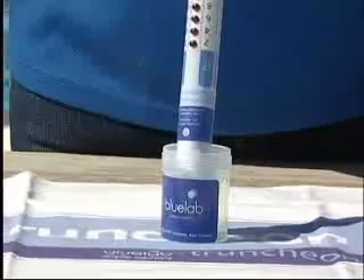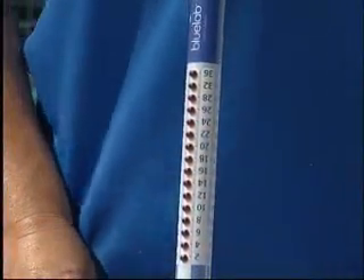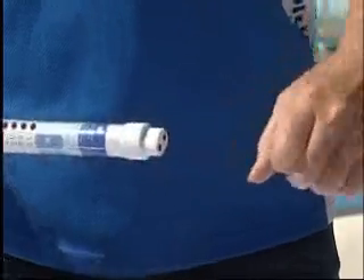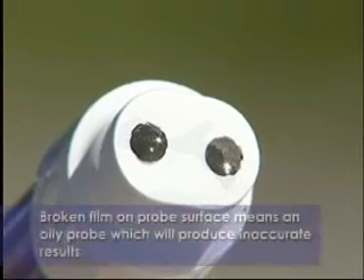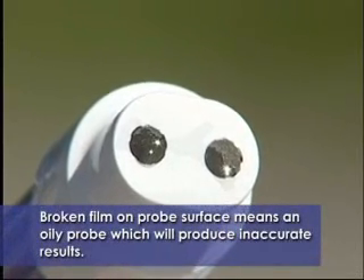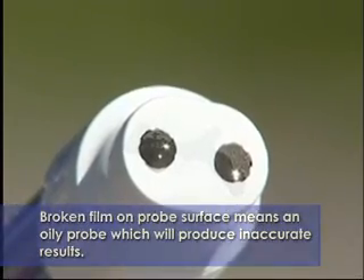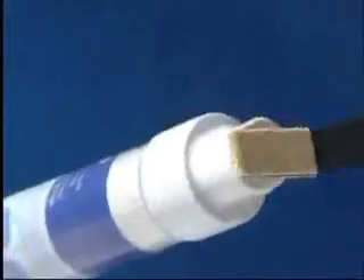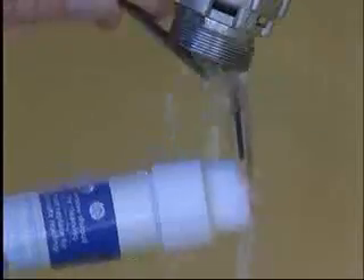If it does not indicate 27, 28, or 29 after the 10 minutes, retry the process by removing the shroud, dipping back into the standard solution, and then looking at the probe face. If the standard solution residue is broken or does not form an even smooth film over the probe face, it means that the probe will require further cleaning. This often occurs when oil residue is present in a solution. Clean again and then test.